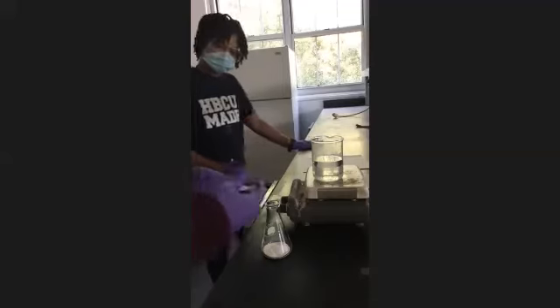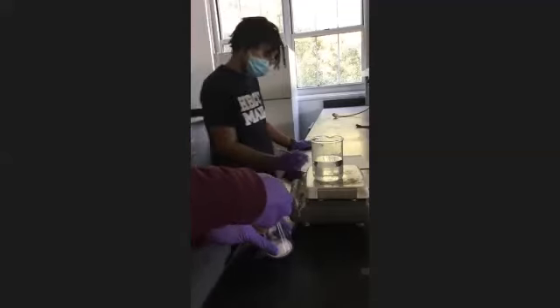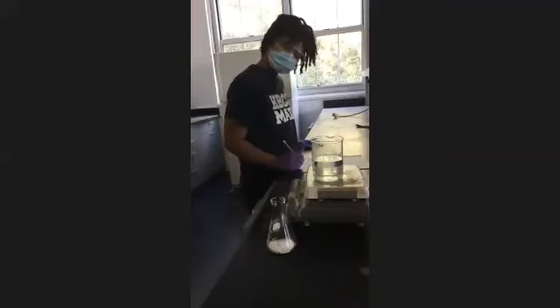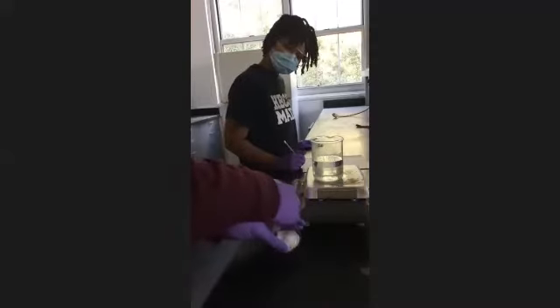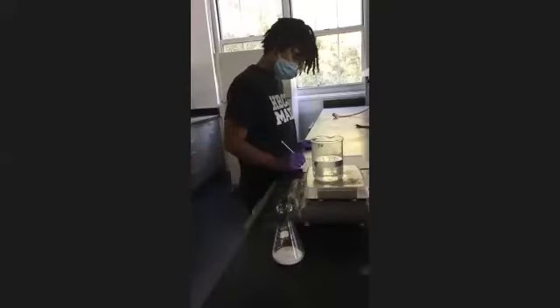So we're gonna add this directly. In the handout, it says to add the acid on an ice bath, but we're working on a smaller scale, so we're not gonna have to cool it down. All right, so don't worry about that part in the procedure. Everything is good. Take my word for it. All right, and this reaction is done under what we call neat conditions. That means there's no solvent. Right? It's neat.